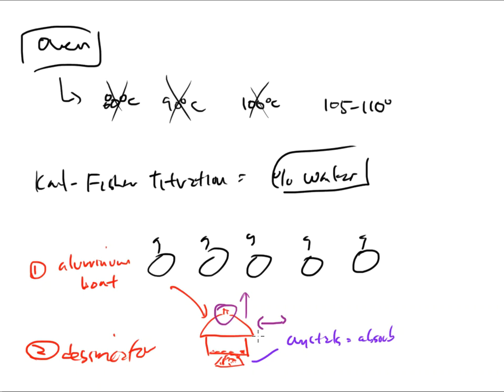But the reason is we have to seal it off from the outside. So that's why the grease is there. If you try to lift the lid straight up, you'll end up breaking the lid. And folks, these things are hundreds of dollars a piece. Hundreds, with an S, of dollars a piece. So don't go break our lids, okay? The only thing that you have to remember is slide the lid to the left or to the right, and you'll be perfectly okay.